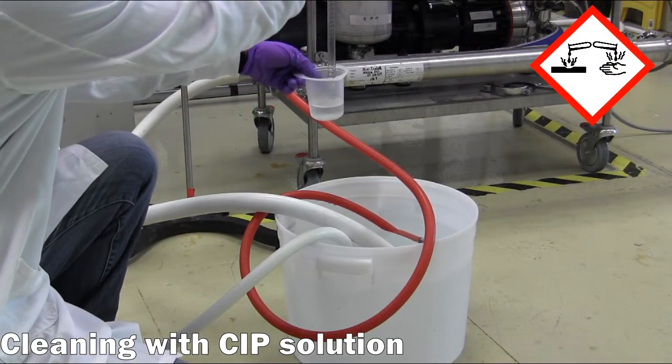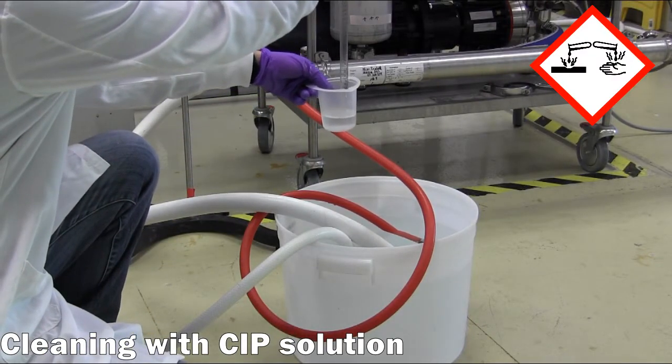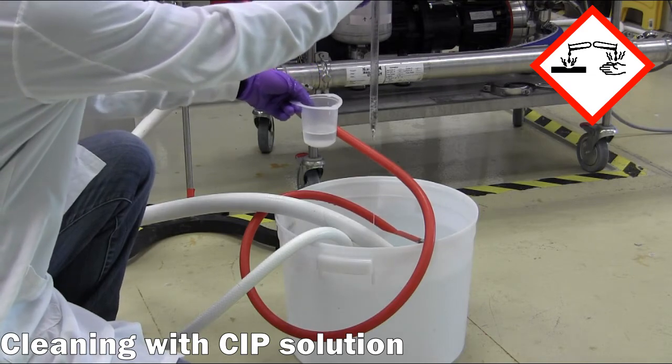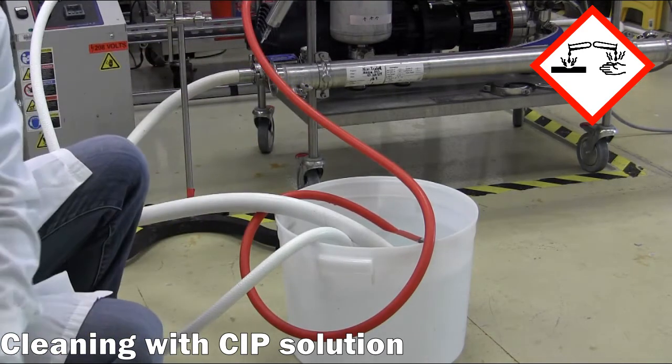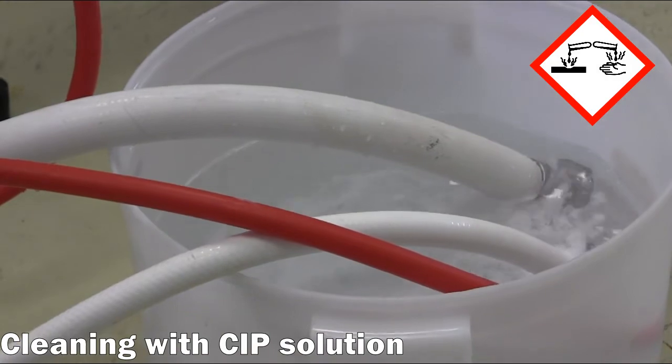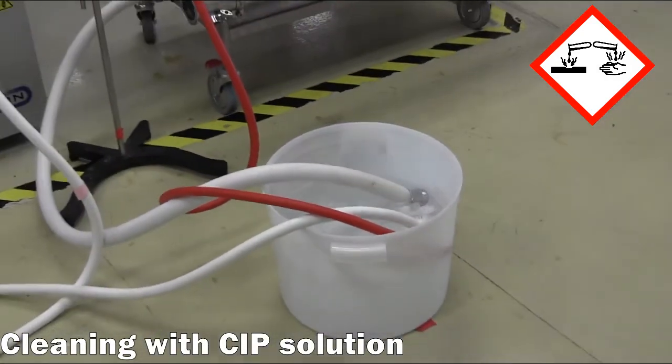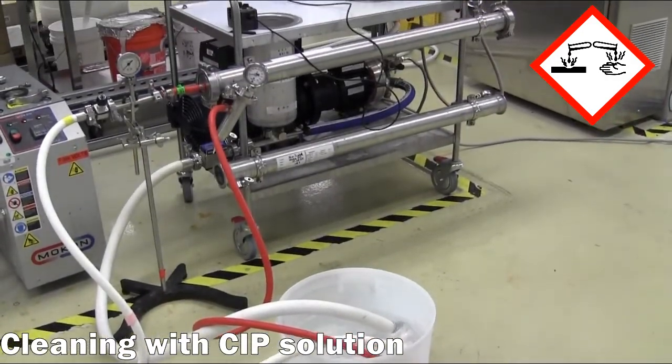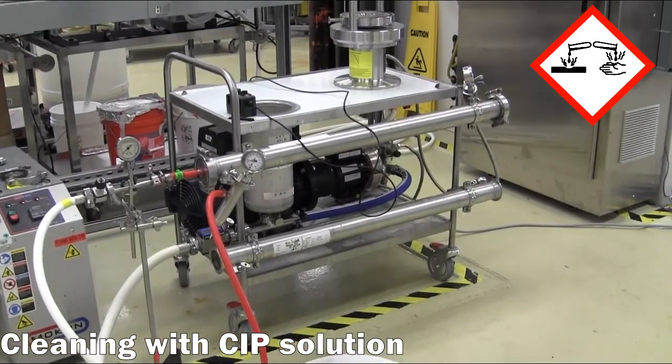Next, CIP100 is introduced to create a caustic cleaning solution that will better clear material from membrane pores and surfaces. Again, all hoses are placed in the CIP solution bucket and the solution is recirculated for 30 minutes.